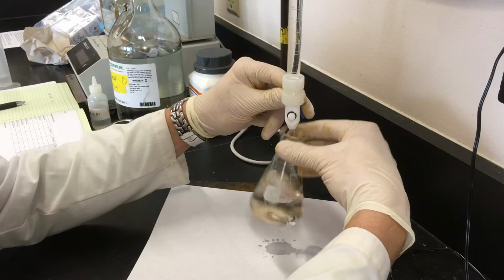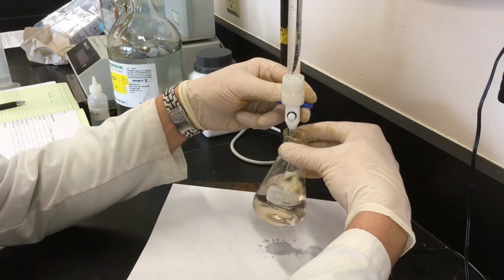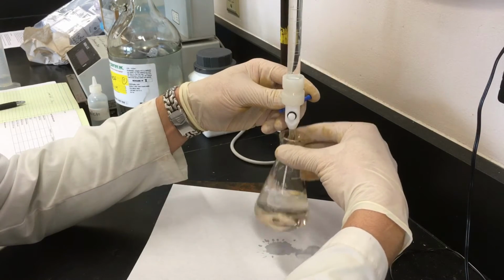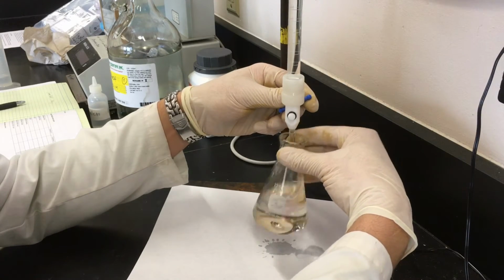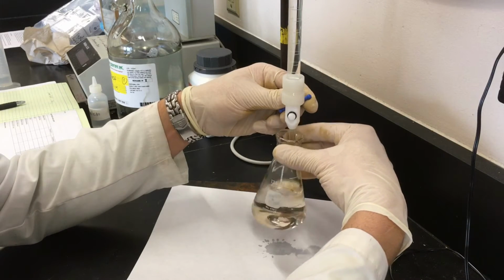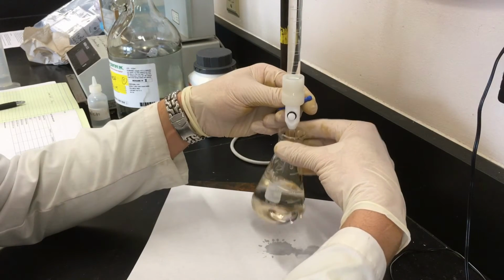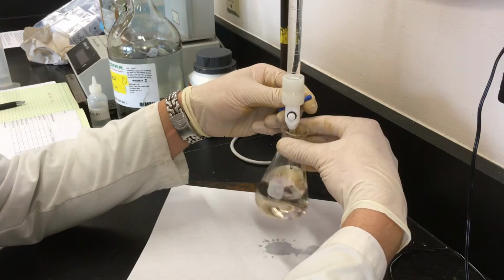So we're going to decrease the flow of NaOH as it seems like we're getting closer. So now we have it drop by drop. The pink is lingering a little bit more, so we must be getting closer still.